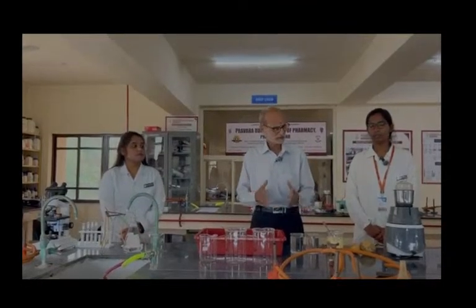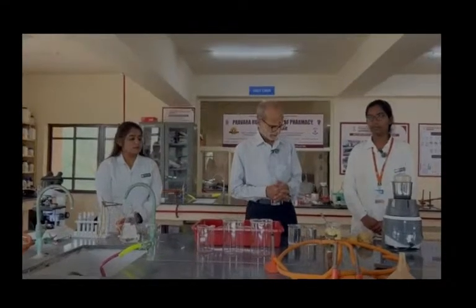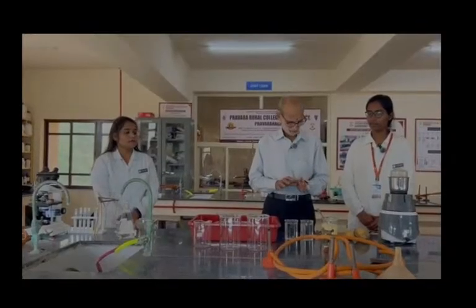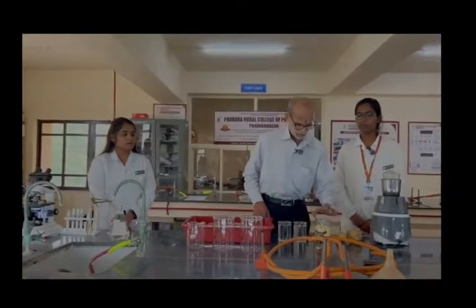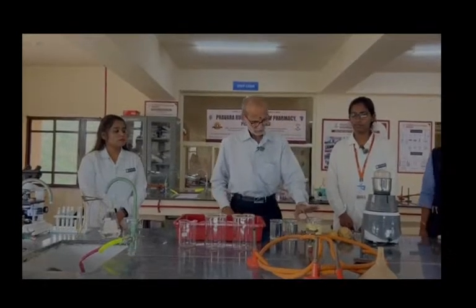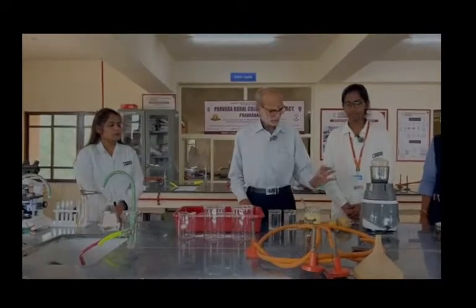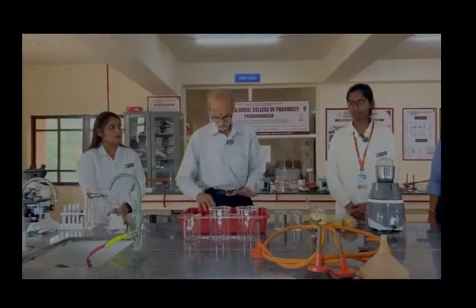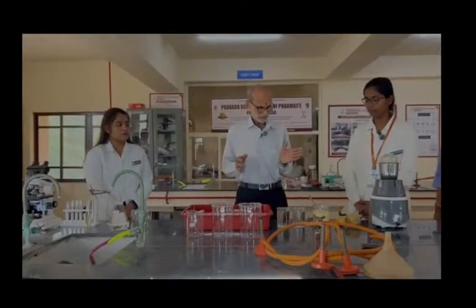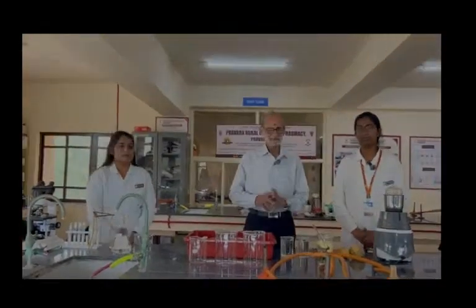These are the important starches, but these 3 are commercially important. We are going to demonstrate to you the starch separation from the potato. Here we have a potato, and we are going to make a pulp in a mixer. Bhakti is going to do that. Here is the mesh which we are using. It is about 60 mesh, and thereafter we will be passing it.